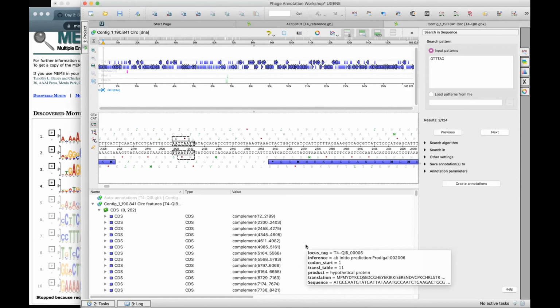So in this case, this method, by just using MEME, will be very time consuming to do the two mismatch rule, because you basically have the motif that's discovered. In the motif, it has some room for error, and I'm not quite sure what the built-in MEME rule for error is. So that would be something to go check in the settings.